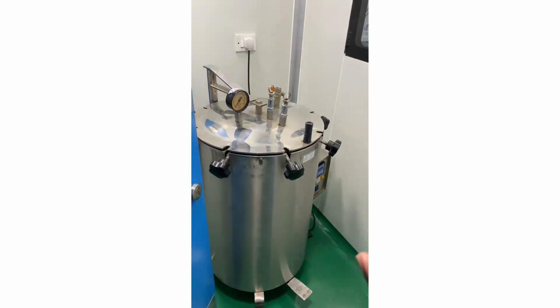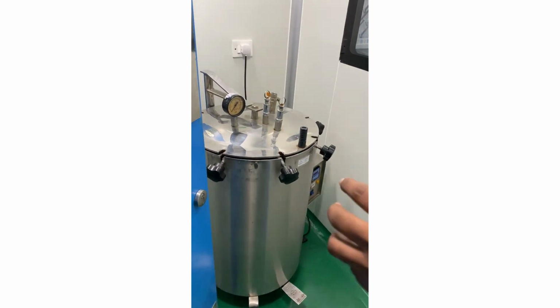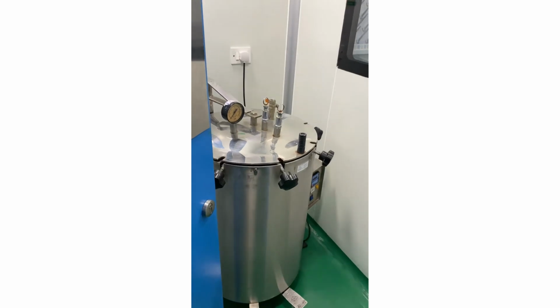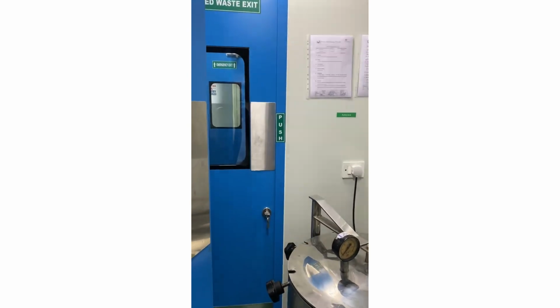Before discarding, we kill the organism, and only then discard. This is the emergency exit and also the waste exit. From here it will go out.